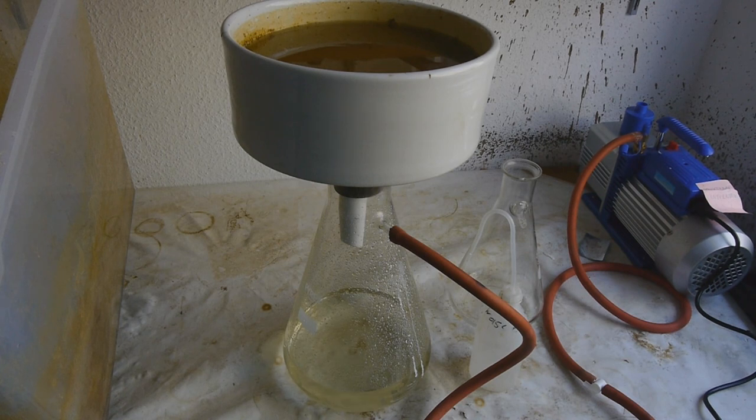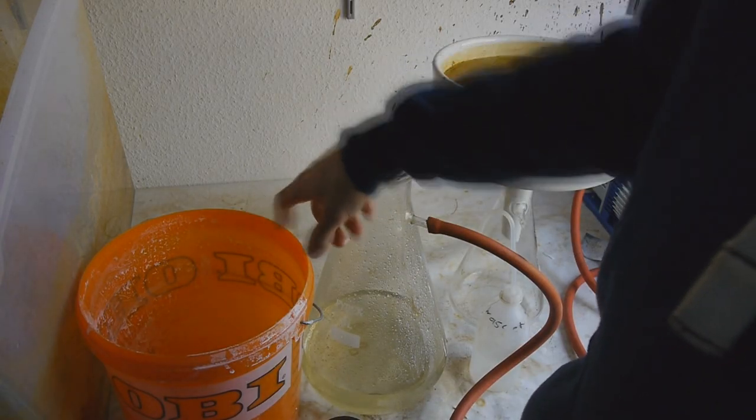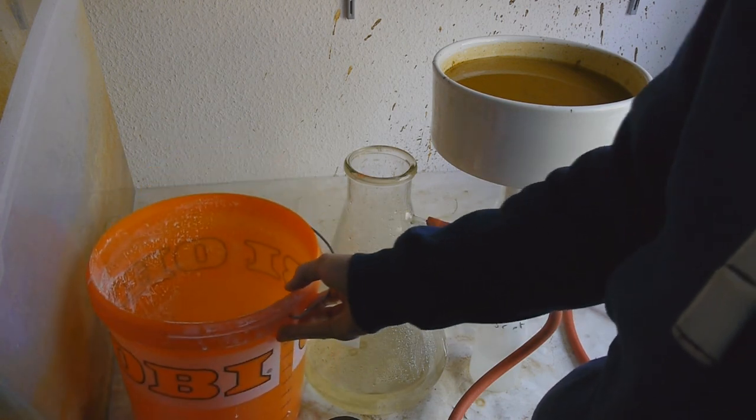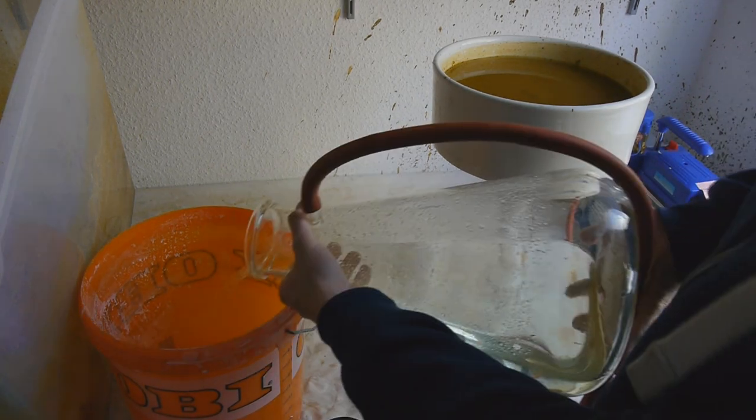Okay, here we are 1 hour later, and as you can see, not exactly a lot happened. But within the next 2 or 3 hours, we should be getting somewhere. Well, I guess it would be a good idea to empty out the flask right now and refill. You can see there's lots of sodium sulfate stuck to the bucket where it was filling in the liquid. So it still needs a lot of washing too.